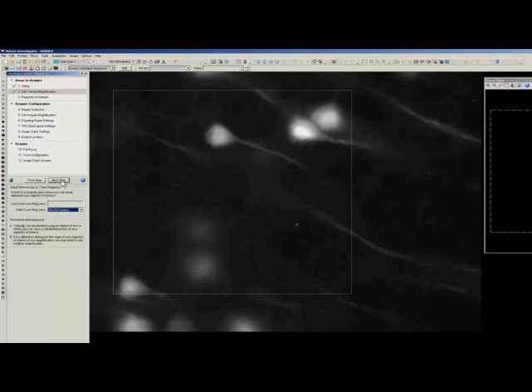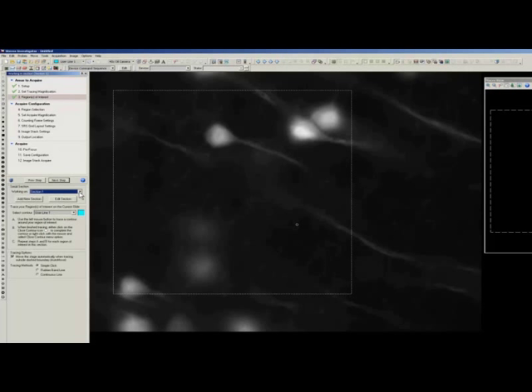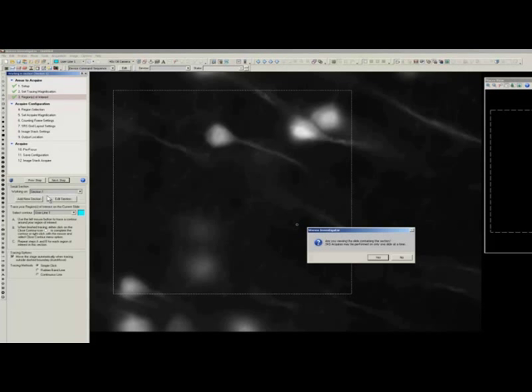Now step two is one of the steps that is slightly different. Here we're going to switch lenses from going to a camera to a laser, right, Sue? We're going to specify what lens we're actually using and the acquisition device that we're using to display the image. And so you'll see in that drop-down menu we had two 40x objectives, one for the camera and one for the laser. And that's all we're pointing out here. We're using the camera right now, so we want to make sure that Stereo Investigator has automatically selected the 40x camera lens.